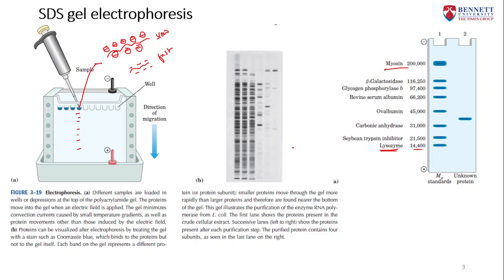So what is the utility of this one? This is a really good analytical tool to find the purity of a protein. For example, this is a protein. So this can tell that this protein is very pure. So purity estimation is one utility of it.